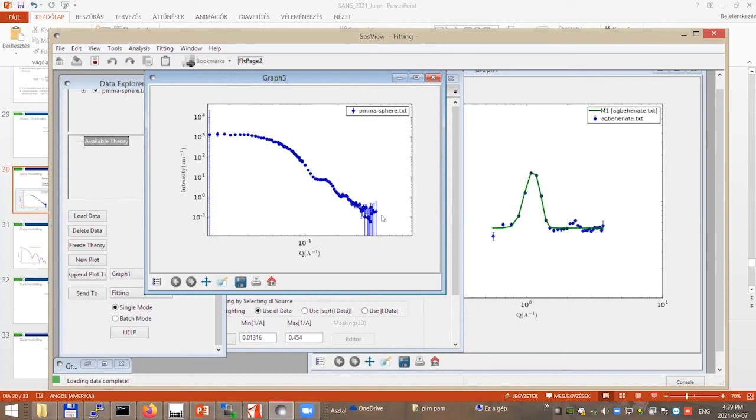The same can be observed at the very end of the Q range. Here, first, the intensity is low, that's why the error bars are big. And second, they are on the edge of the detector, and very often they just fall off the edge of the detector if the beam is not well centered in the middle of the detector. But still these data are usable.